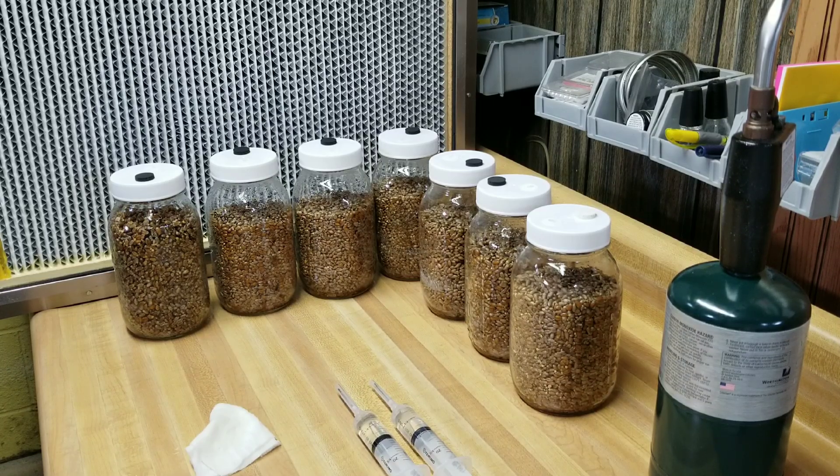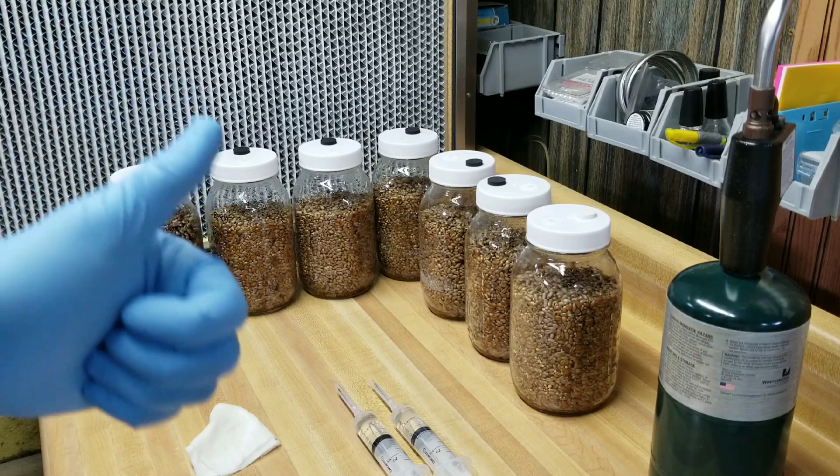Once you do that the jar is going to look a lot better - I'll show you a close-up. Then we'll move them to incubation, and once you incubate them for a few days the moisture will redistribute and they're going to look perfect.